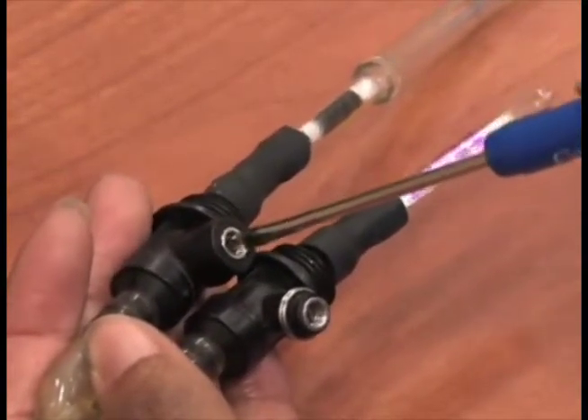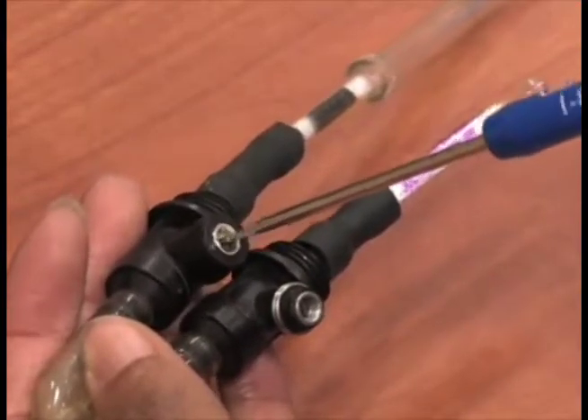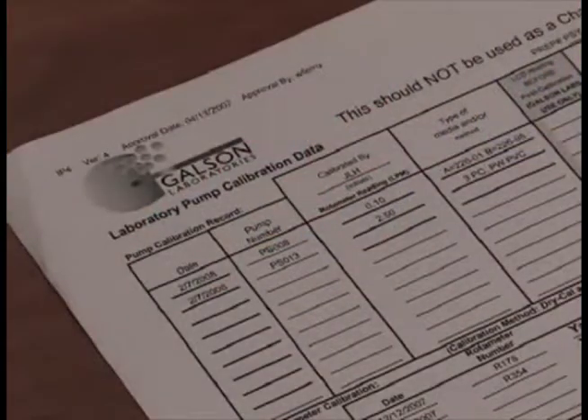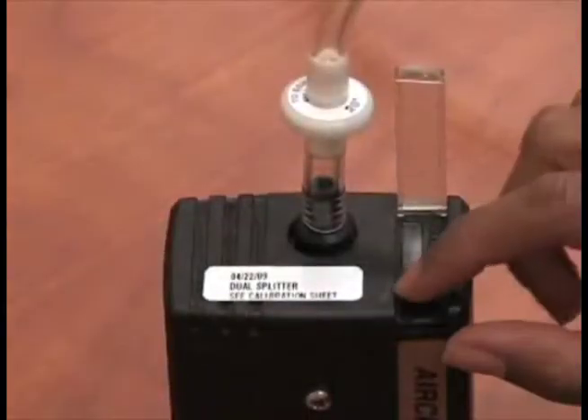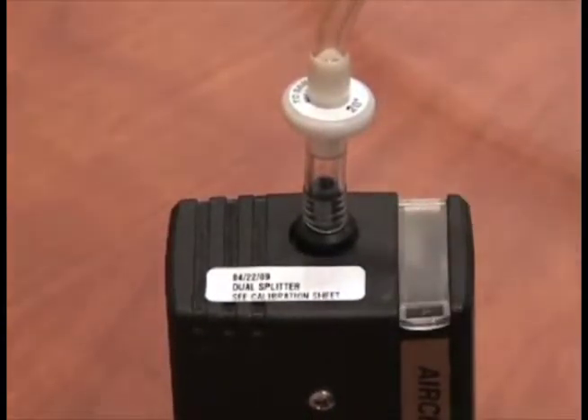Pump calibration with splitters is done the same as single sample calibration, except you calibrate and adjust each port one at a time. Review the pump calibration data form to determine what type of media was used on which port during pre-calibration. To calibrate the pumps, they must be charged. If the pumps have not been charged within the past 48 hours, you must recharge the pumps prior to sampling.